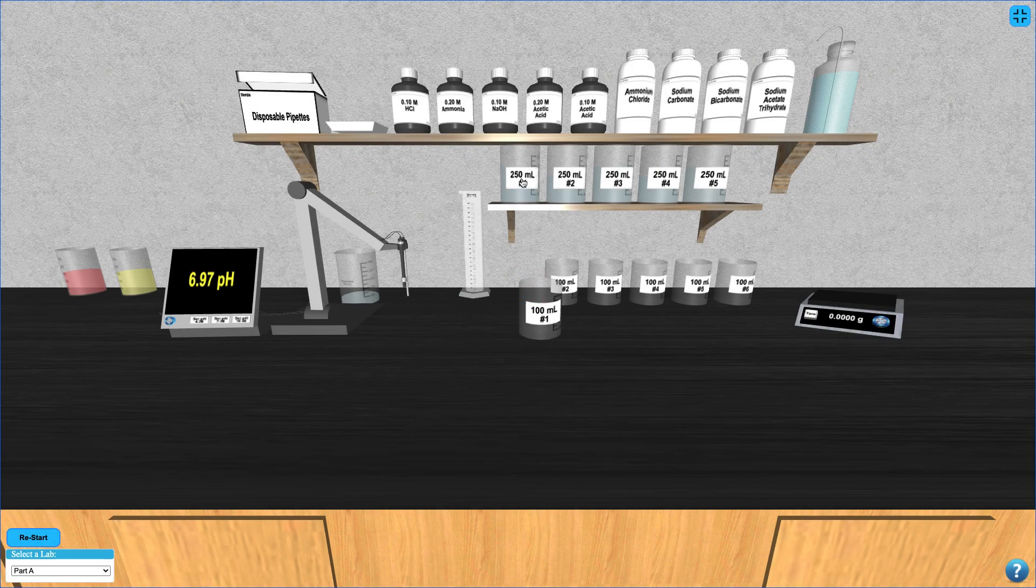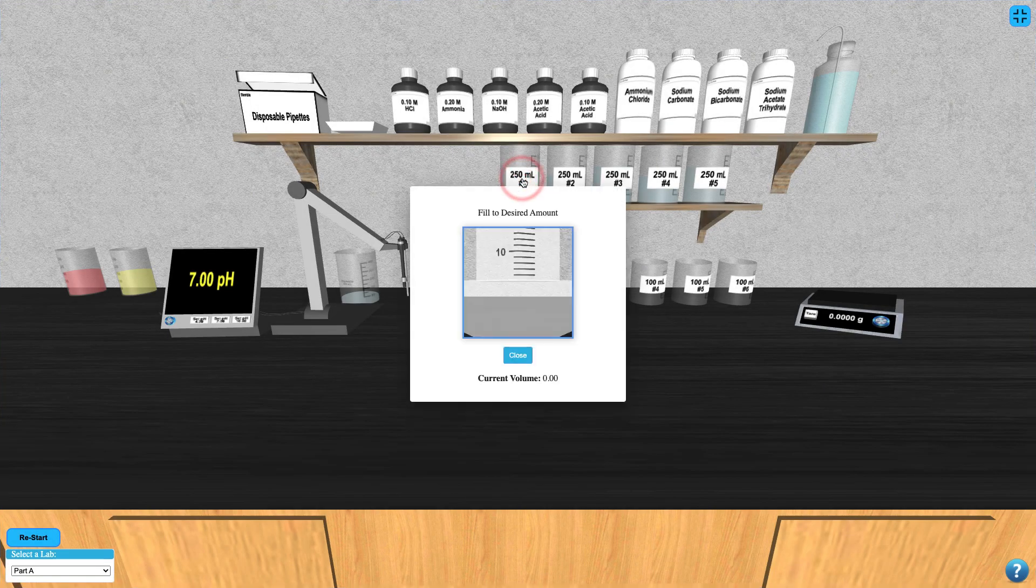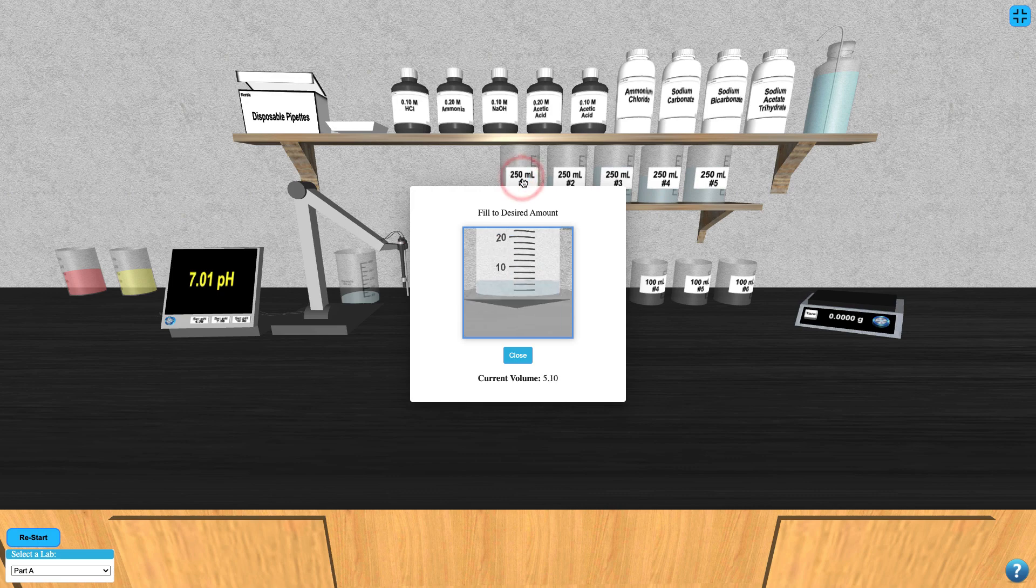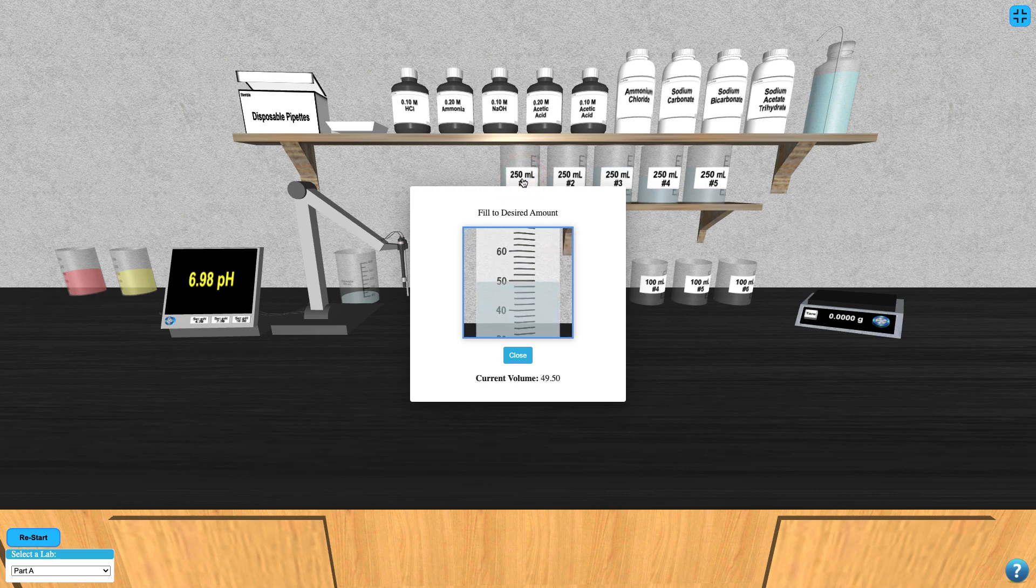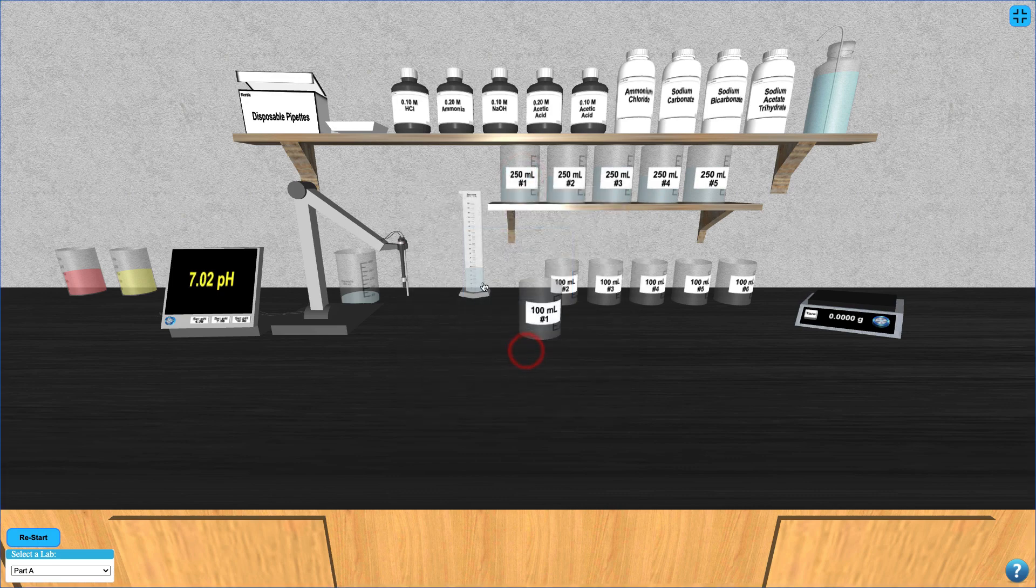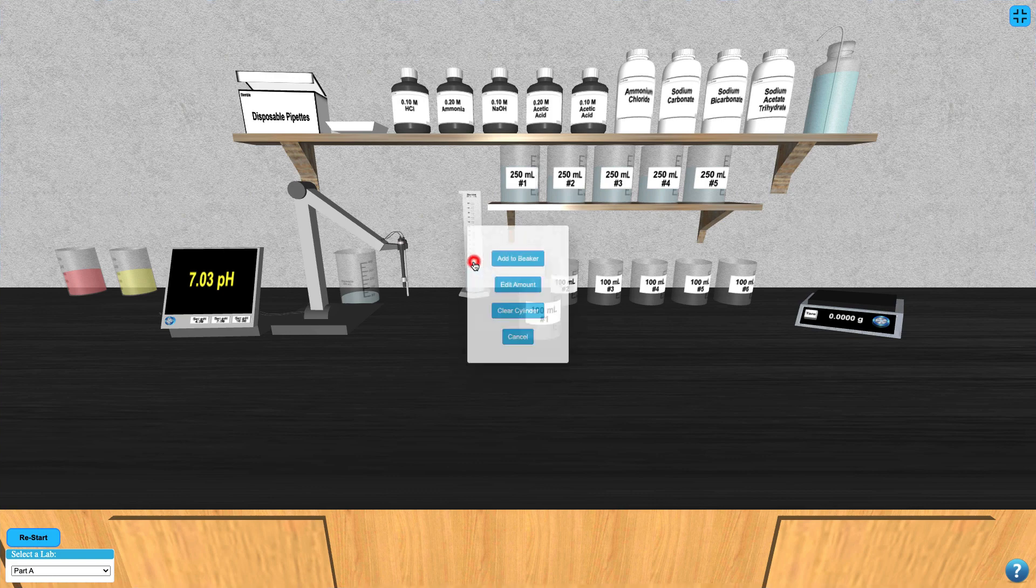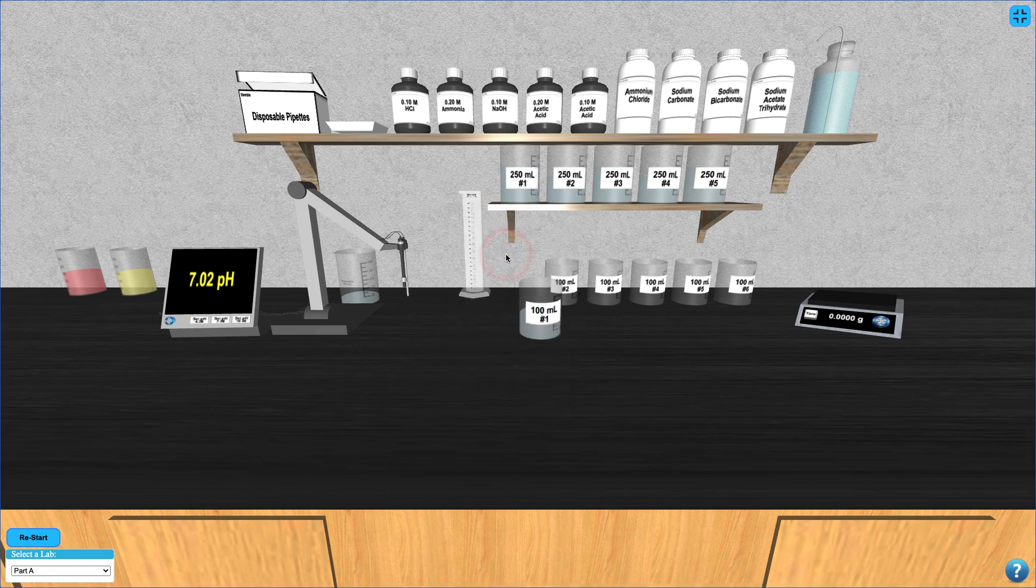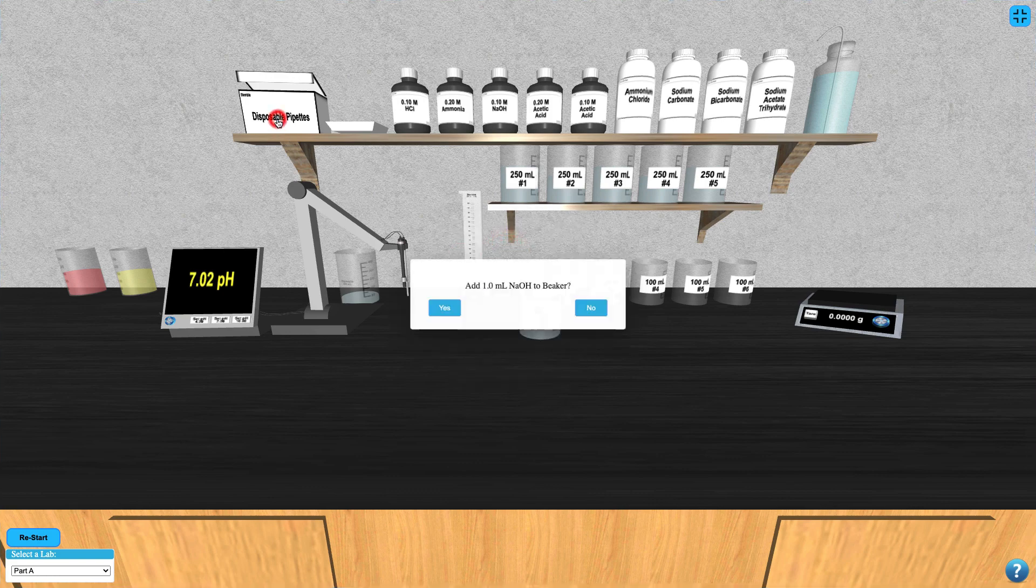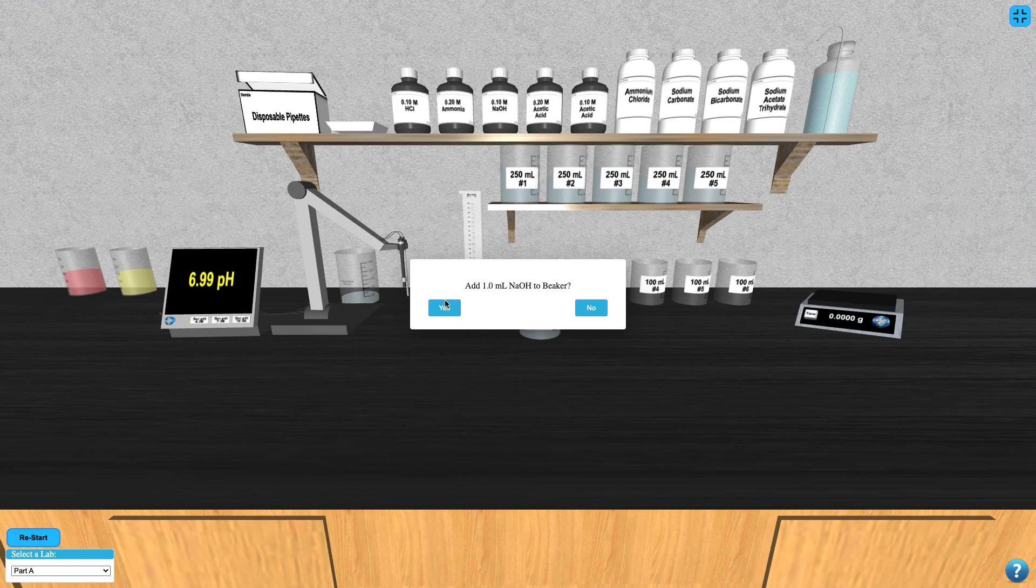To do this, select a 100 milliliter beaker from your set and then add the required buffer by clicking on it. Once you add the buffer solution, click the disposable pipettes box to dispense one milliliter of the required strong acid or strong base.